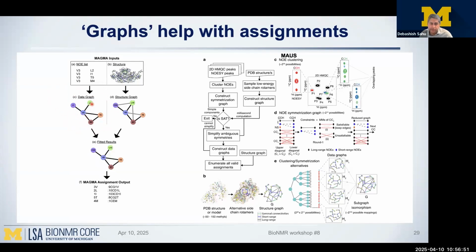Again, this is taken with a grain of salt because you may not know the assignments, but some of them you might know because you would have done your site-directed mutagenesis. And then you go to the structure. So you do your PDB, you download the structure. This is that homodimer structure that I talked about. But from here, you know what is going to be close to what because this is the ground truth, right? So you know that leucine 10 is going to be close to valine 9, and that is going to be close to this isoleucine 103, methionine 1, and threonine 8.